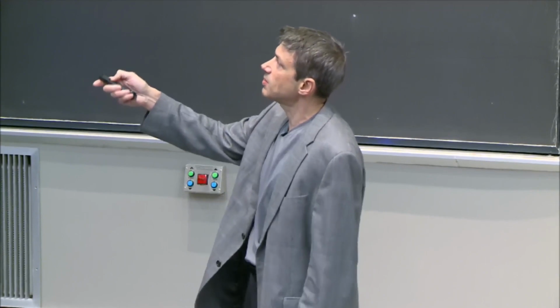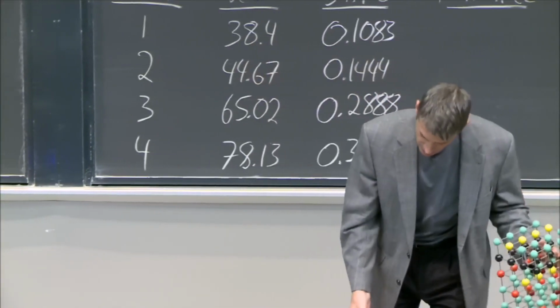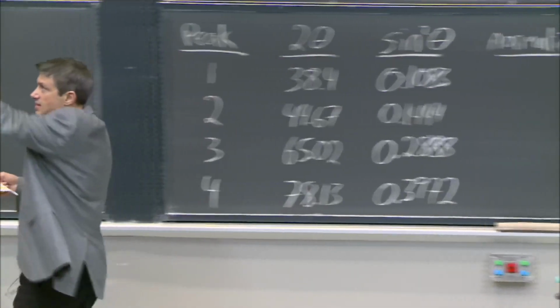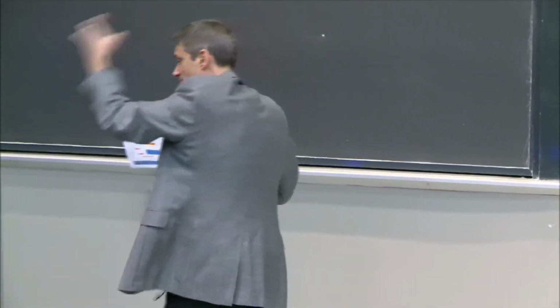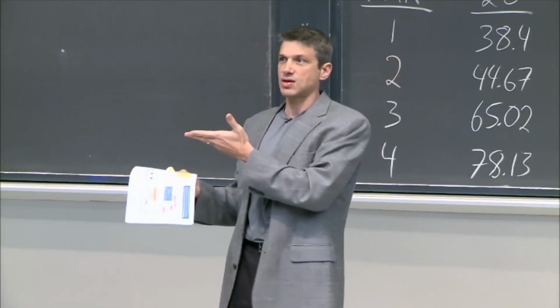That's the Bragg condition. And remember, in this class, it could be any multiple, but here we're just going to assume n equals 1 because it's the easiest case. Okay, good. That's the Bragg condition. Now, we did something beyond just that, because that tells us what the wavelength has to be to get a spot, something the detector can see, because it constructively interferes. Everything else is destructive, no signal.